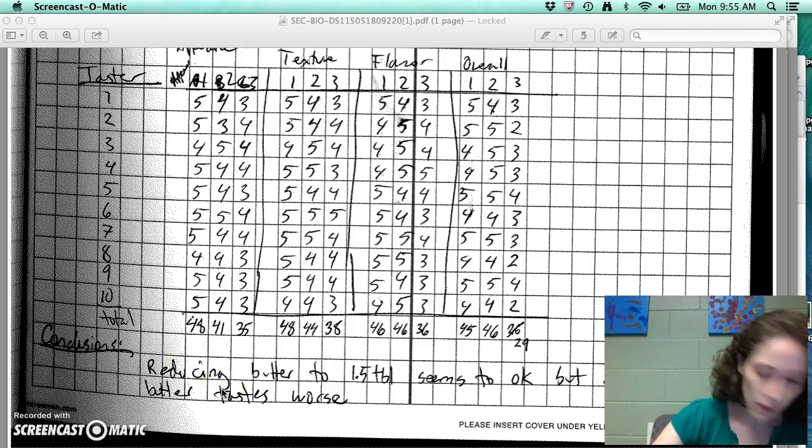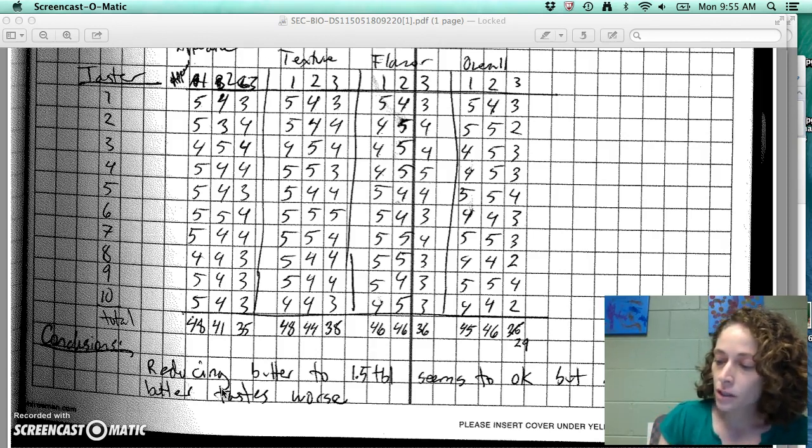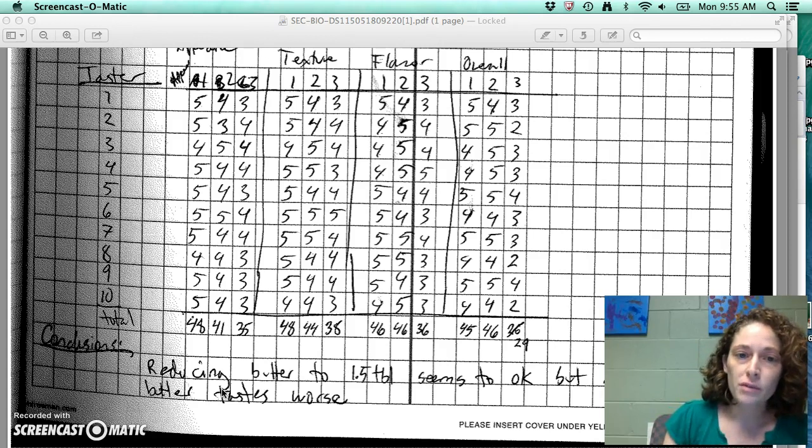Okay, in terms of other things for your lab notebook that I want to mention, so never write in pencil. You should always be writing in pen, right? Pencil can be erased and changed later, which makes it not a legal document anymore. If you do make a mistake, never white it out, never completely cross it out, just mark a big X over it, so you've marked it as not something that should be read, but it is still there. You're not erasing any data potentially, right?